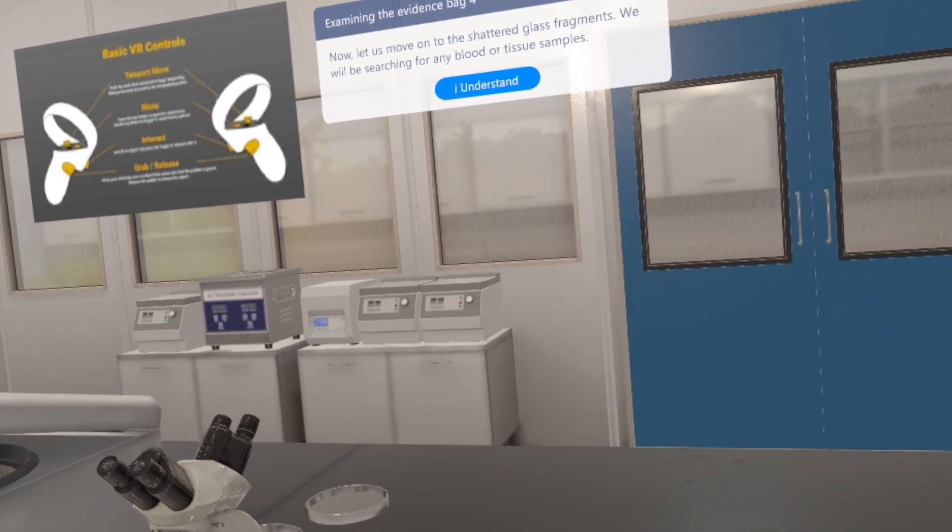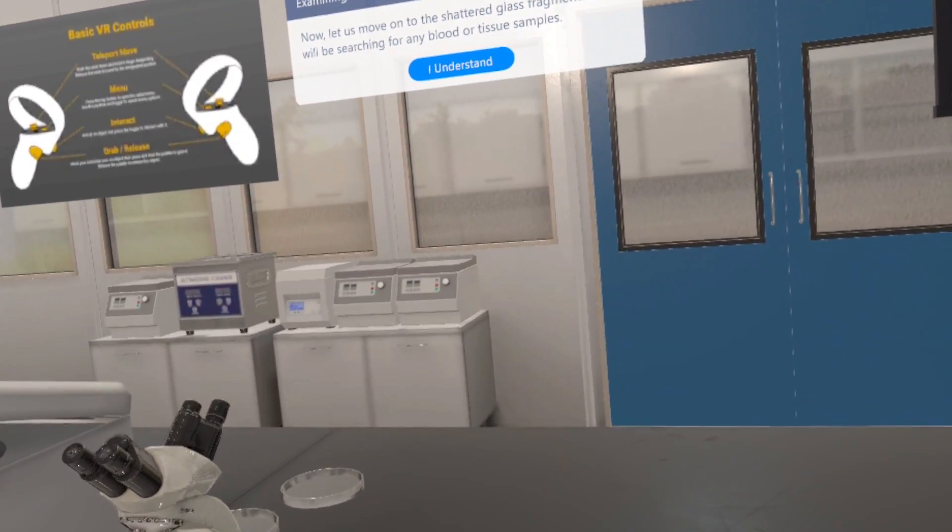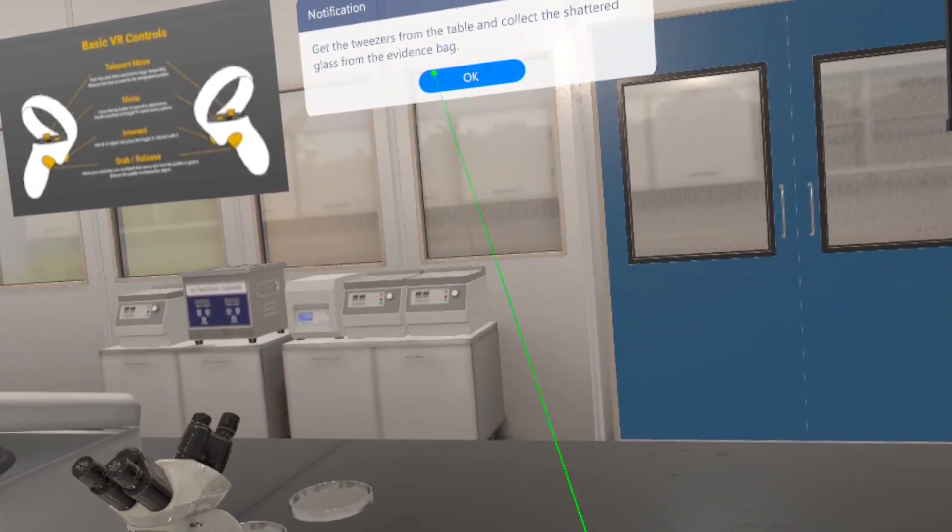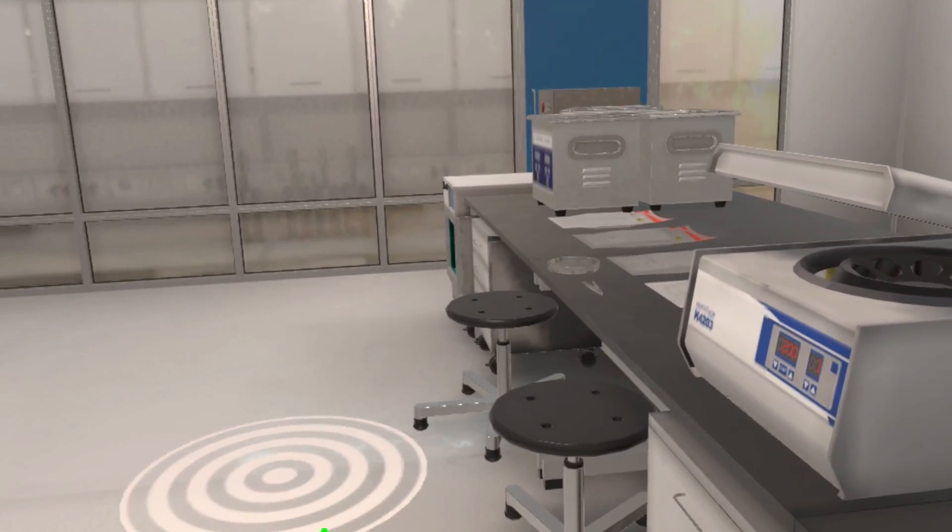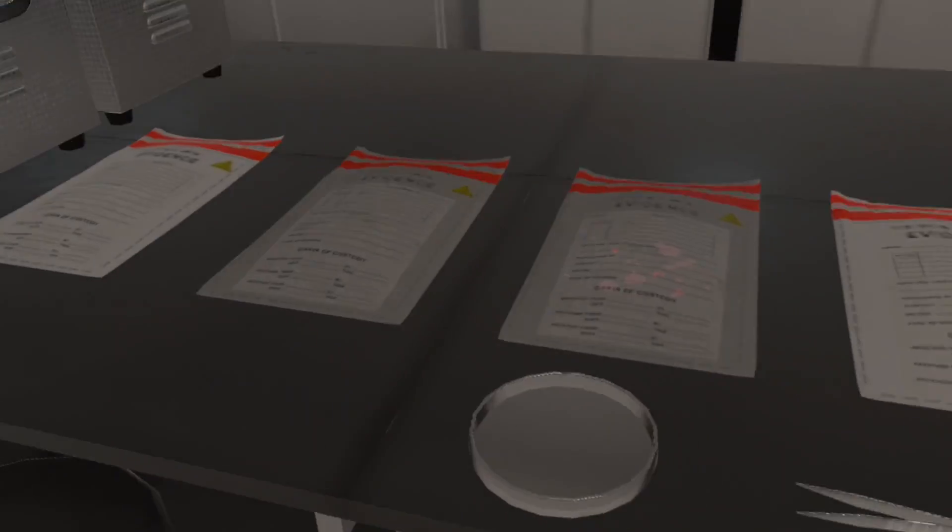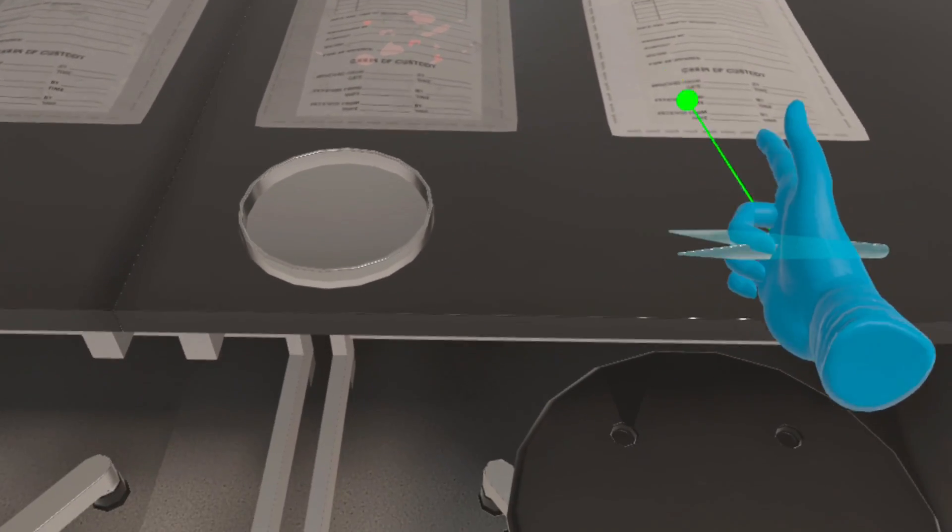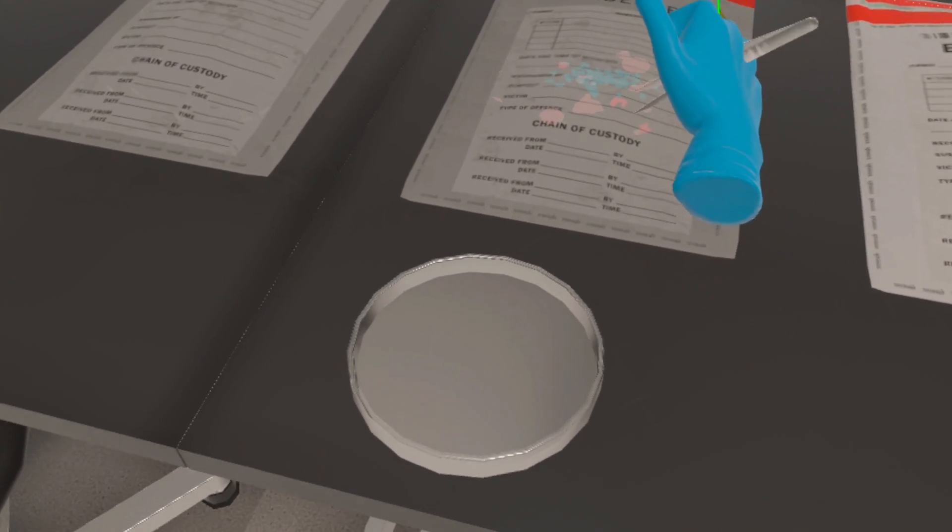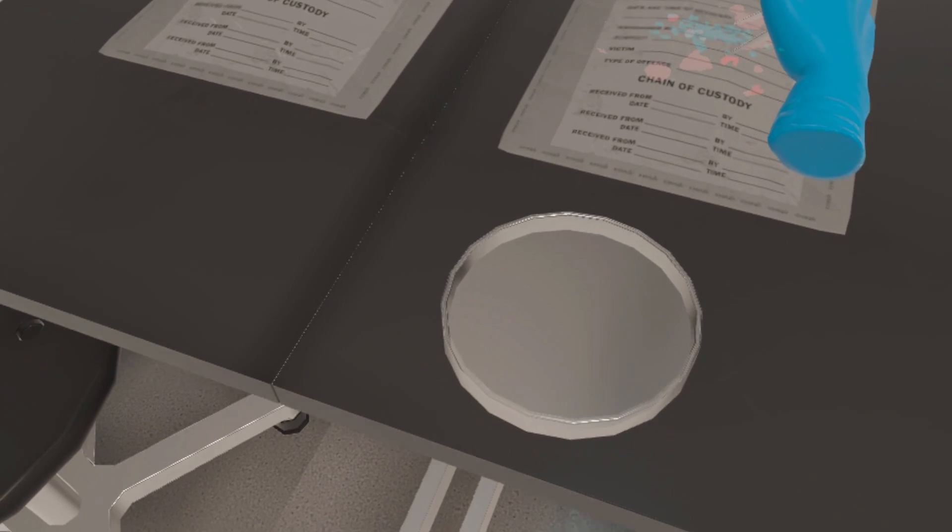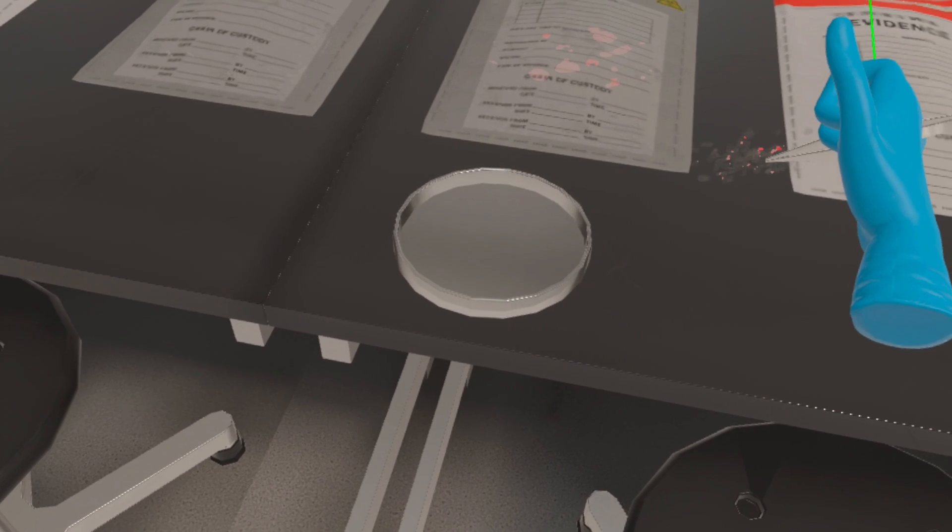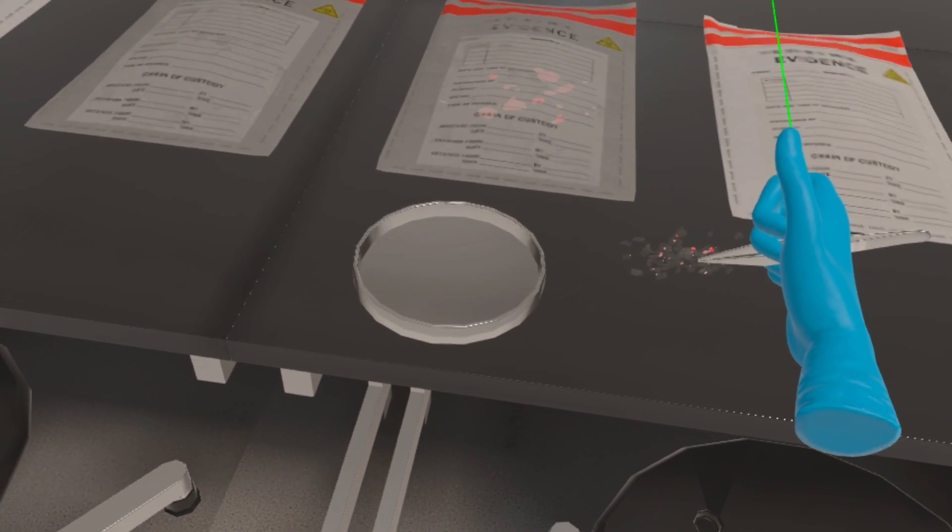Now let us move on to the shattered glass fragments. We will be searching for any blood or tissue samples. Get the tweezers from the table and collect the shattered glass from the evidence bag. Place the shattered glass in the petri dish and place it under the UV light.